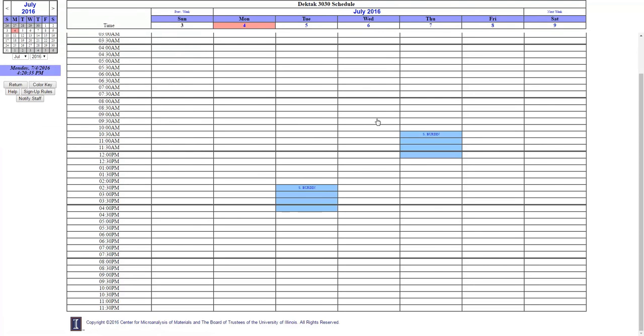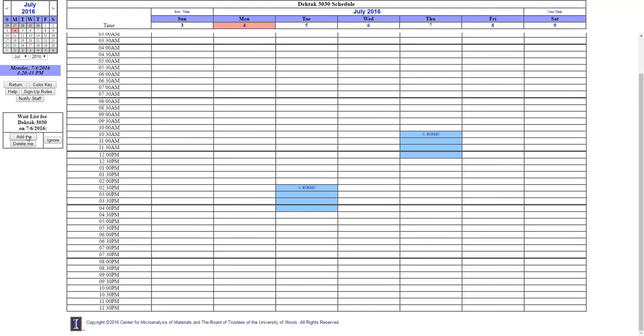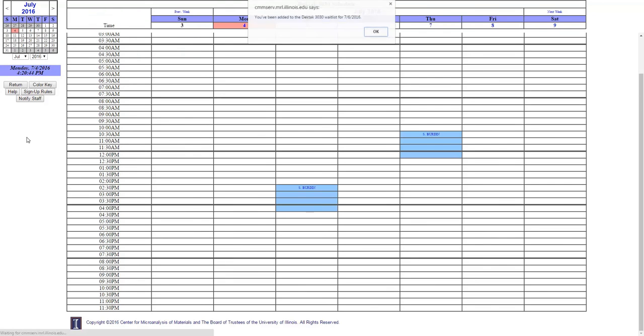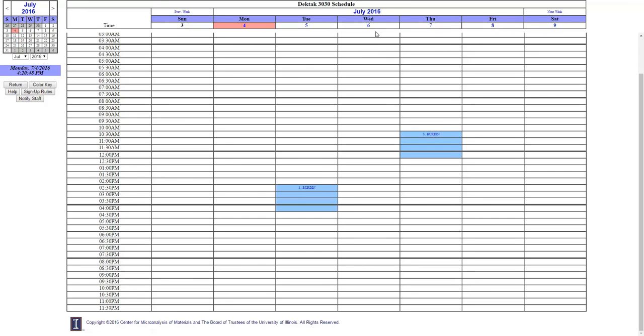If you want to know when another researcher has canceled time, you may add yourself to the waitlist by clicking on the blue links at the top of the page, and then you will be added to the waitlist for that day, and you will get an email when someone cancels time.